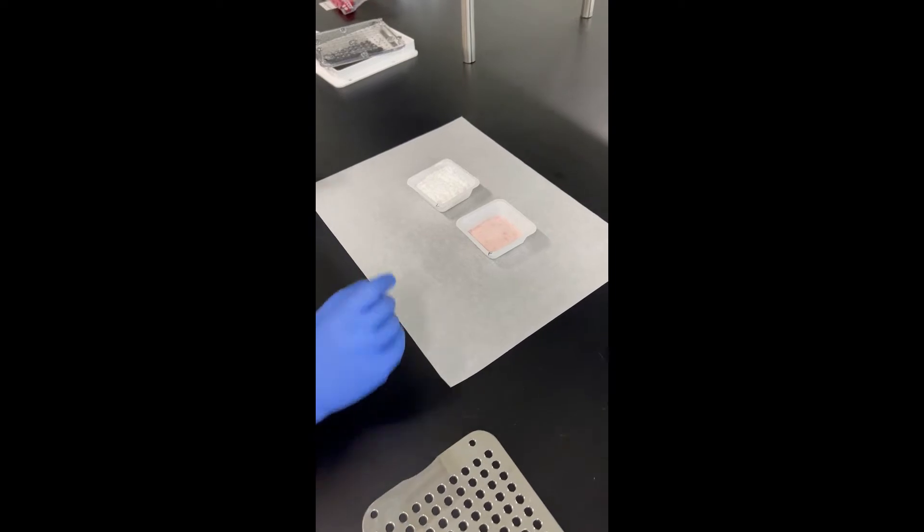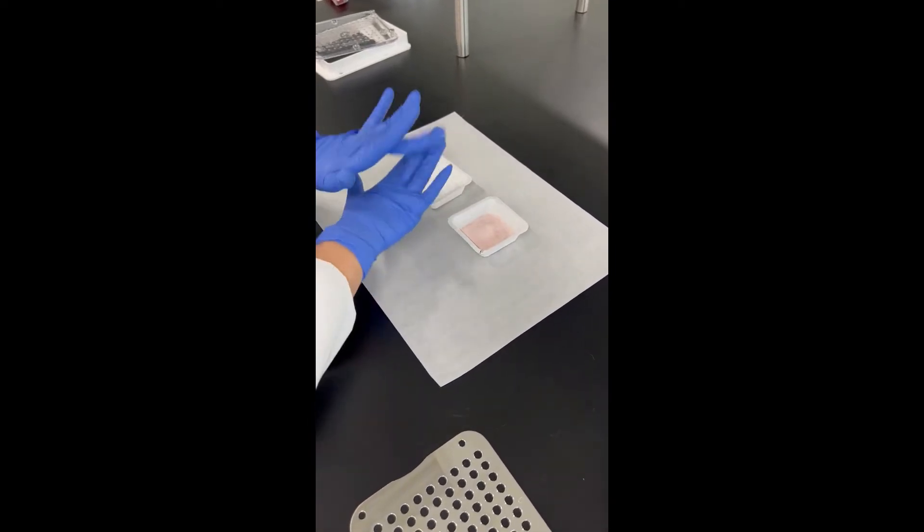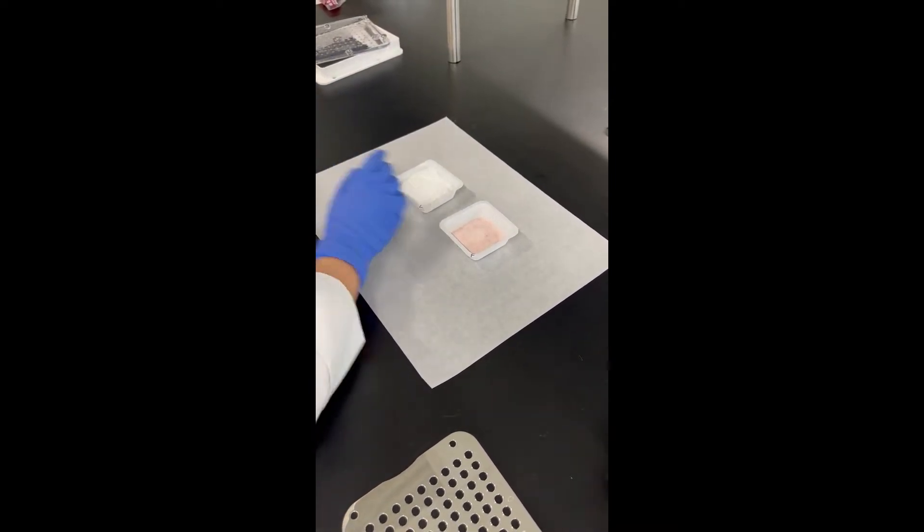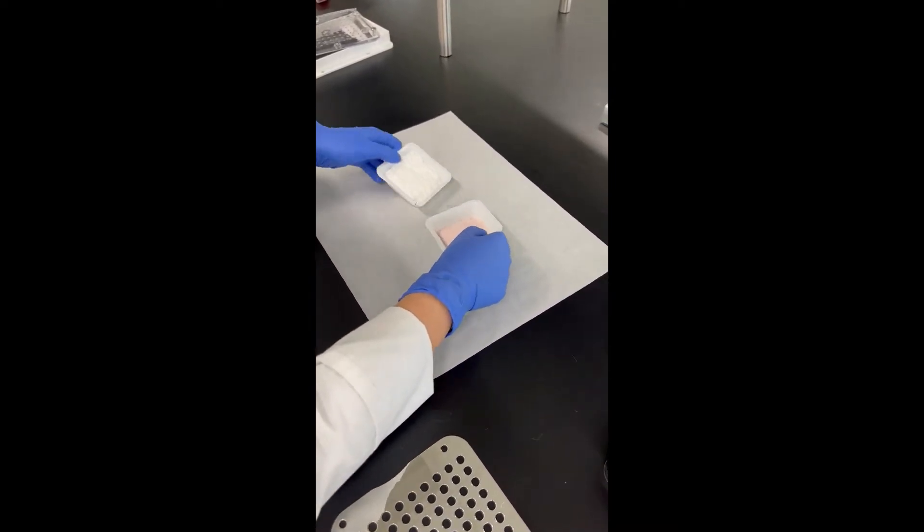Today we're going to be making furosemide capsules, so we're going to go ahead and weigh out all of our materials. In class you will learn how to weigh out the lactose. So we've got to go ahead and get this mixed together.